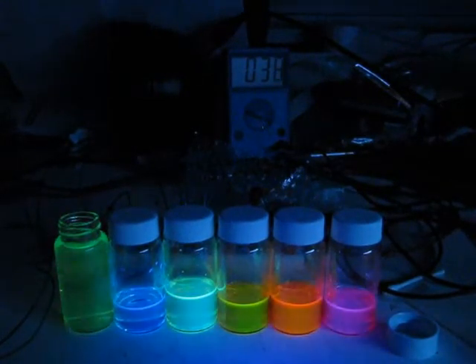Now, that's all fine and dandy, but what is a fiber-coupled spectrofluorimeter? Essentially, it consists of a light source that produces an excitation light at a certain wavelength, and then you have a detector, in this case a pin photodiode. That pin photodiode senses the tiny amount of light produced by fluorescence, and it converts it into a voltage signal which we can read and analyze.